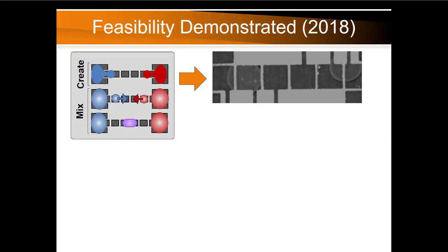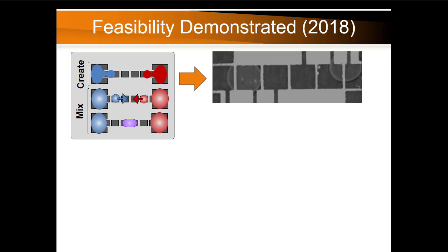This was an inkjet printed device where we were taking two droplets, right? Now I'm a mechanical engineer, so I think about DNA as building stuff like Lego. We have one brick of DNA in the blue droplet, one brick in the red droplet. We create droplets, bring them together, mix them together, and hopefully the chemical reaction takes place and these two DNA bricks, which look like Lego blocks, come together to make a longer DNA brick, right? This was something we did on an inkjet printed device.